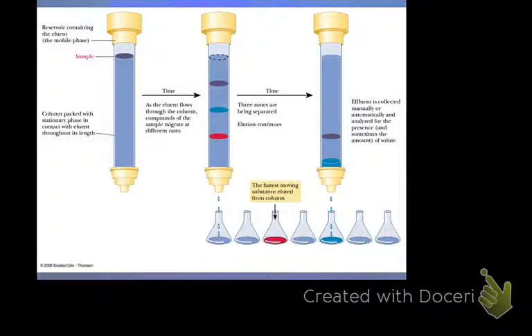This is just a little cartoon showing this. Of course, they've colored it right now. But the whole idea is you've got some type of stationary phase inside the column. It doesn't move. You've added a solution that has multiple proteins or multiple things in it. Then as time goes on, either just due to gravity pulling it down, or you can put it on either low pressure or high pressure to force it to go through, these solutions are going to start to be eluted. Anything that really likes that column, whatever that column is made of, is going to stay in the column longer. So whatever that color is, it really likes it. Whereas this color doesn't have a high affinity for the column material, and so it's going to come off first.